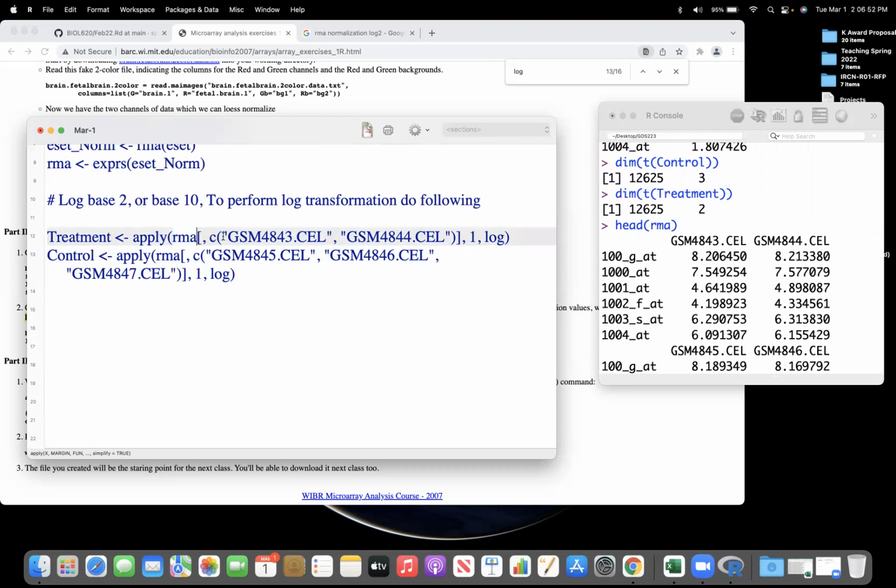The next is the square bracket. You see a square bracket here? This entire square bracket here. In the square bracket, there is this comma here. Any wild guess why? What is the use of this comma? Did you notice there is a comma here? Why do you think there should be a comma?